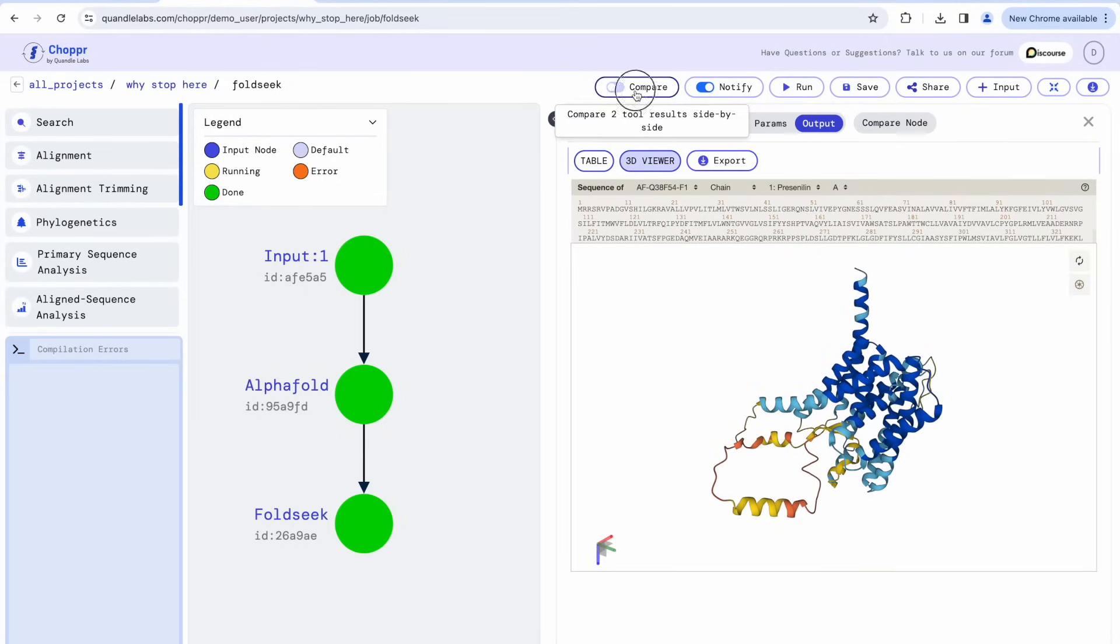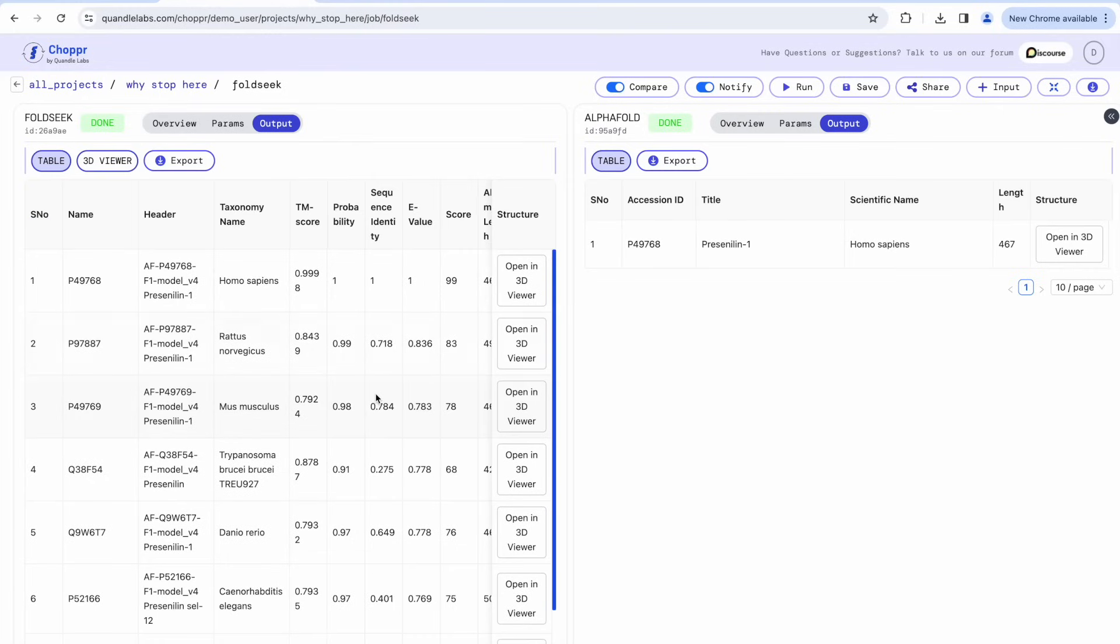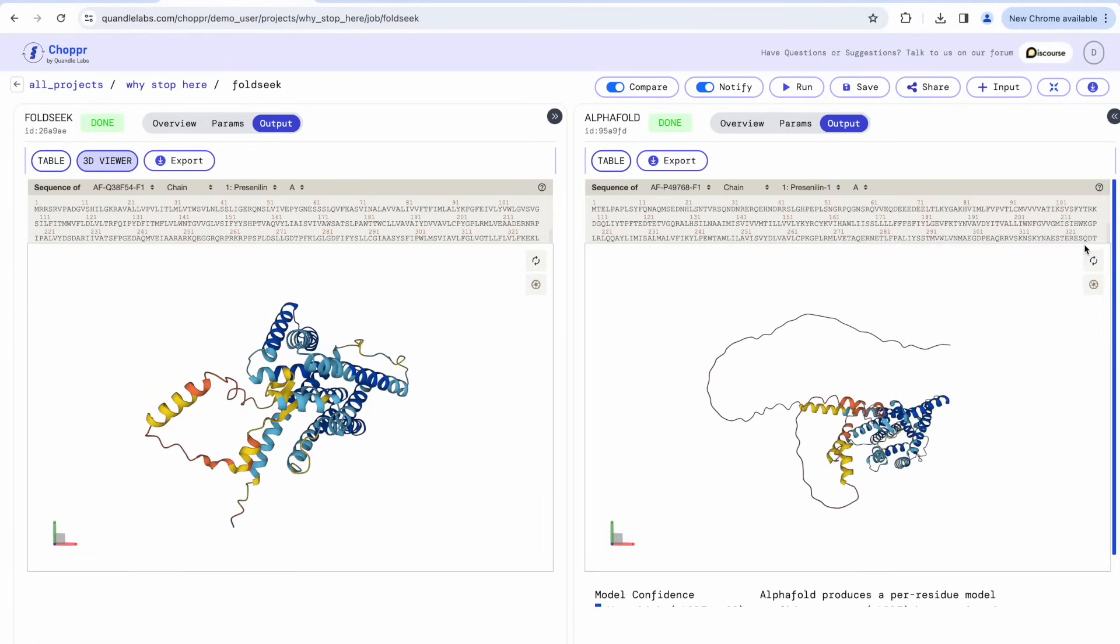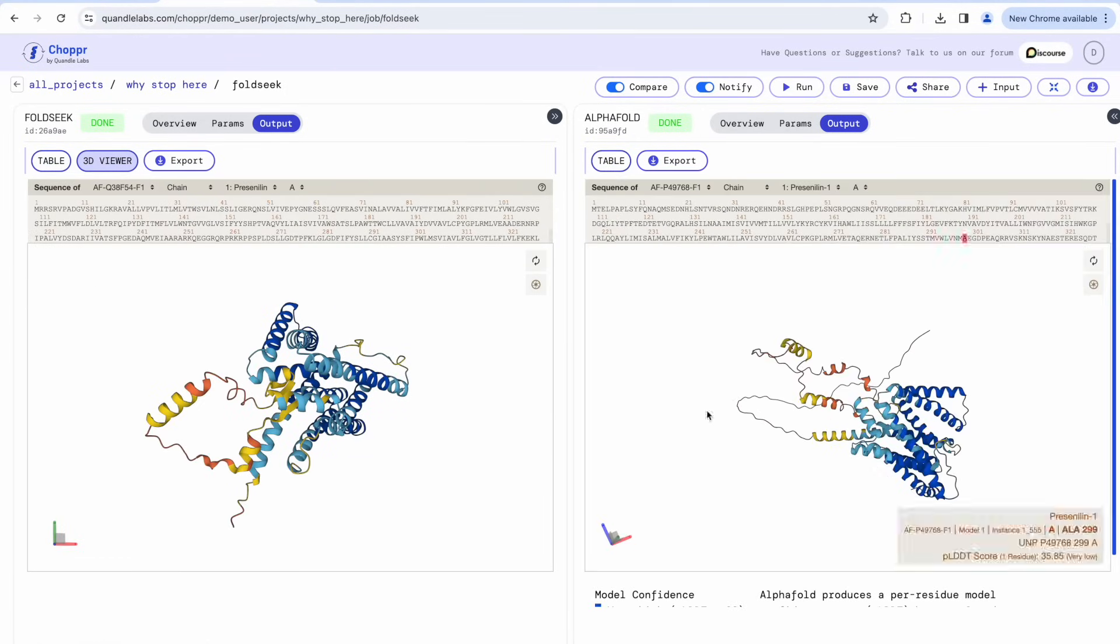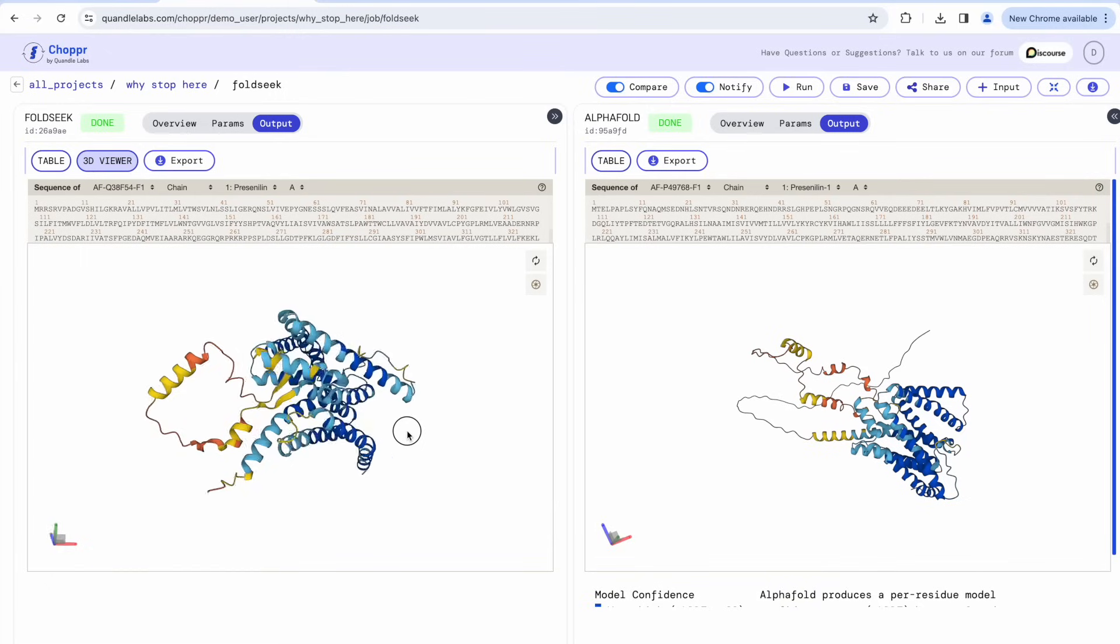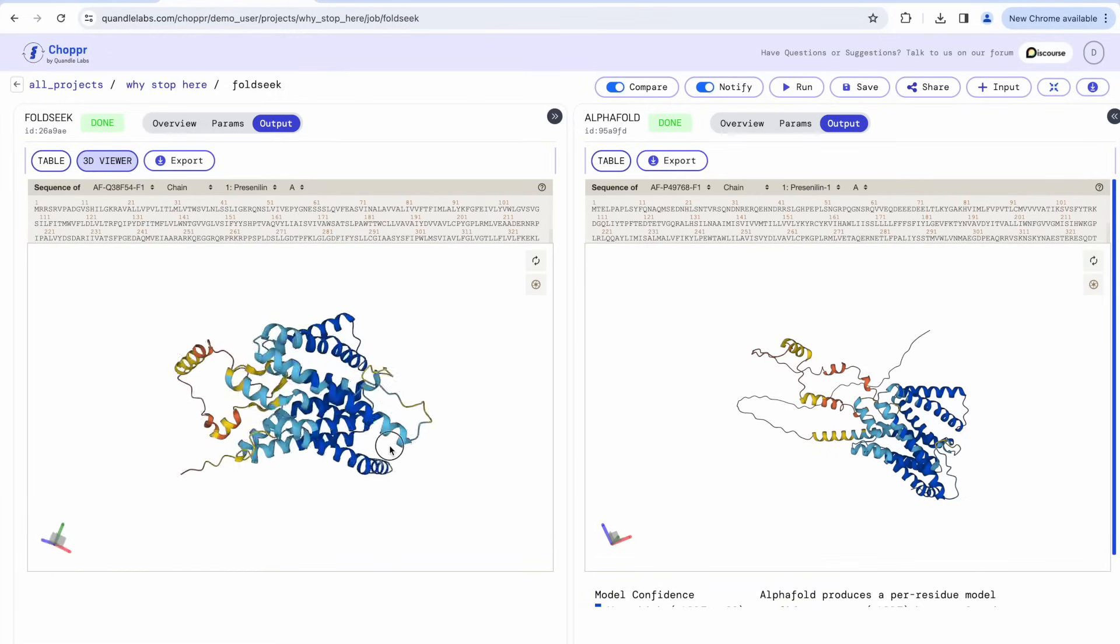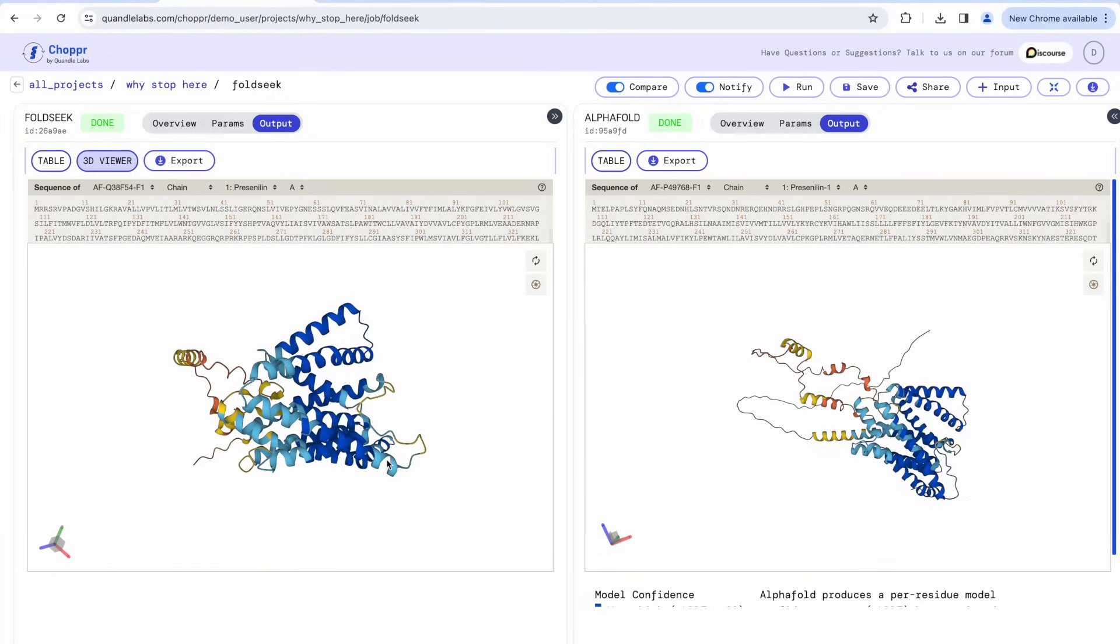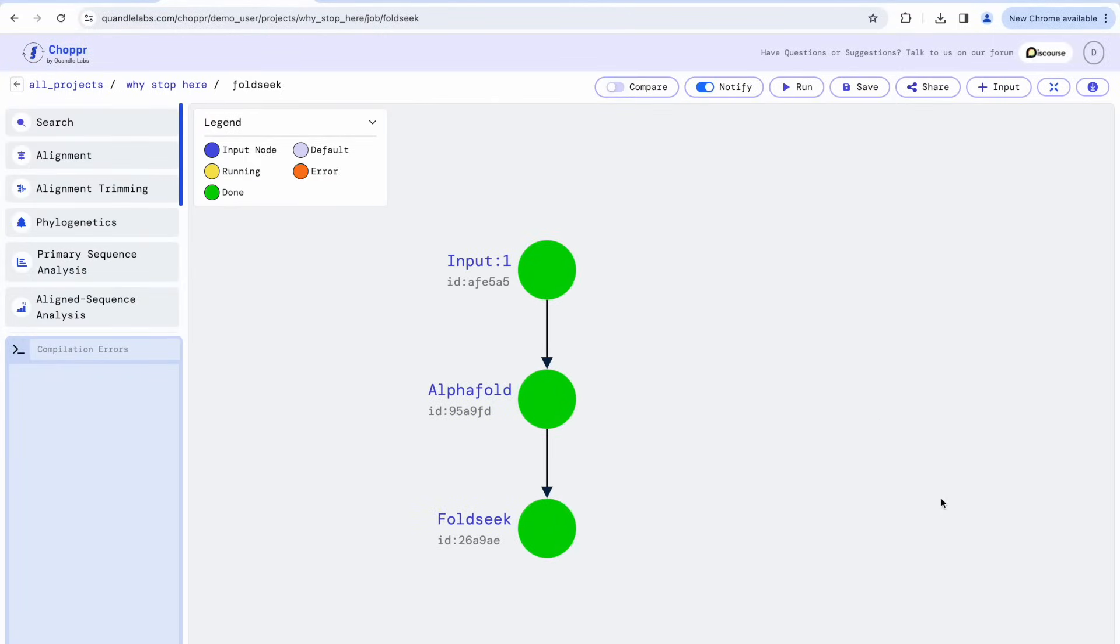To compare results side-by-side, we turn on the Compare toggle and select both FoldSeq and AlphaFold. On the right, we have the input structure from AlphaFold and on the left, let's choose the trypanosoma structure. Visually, the structures are very similar. Indeed, such a sequence would have been missed if we were to depend only on sequence identity.